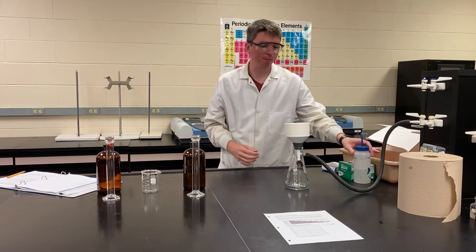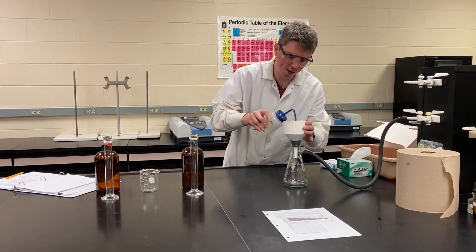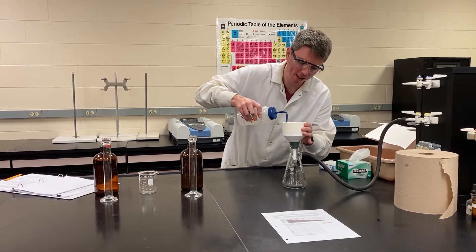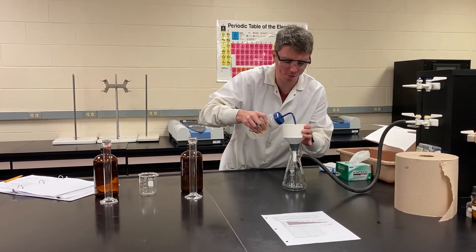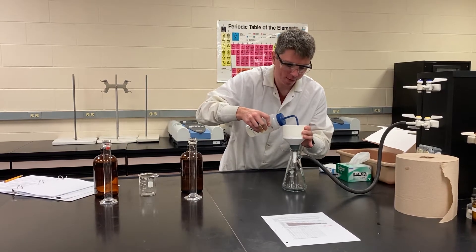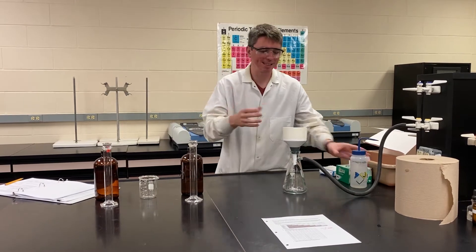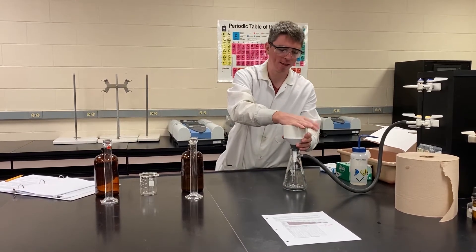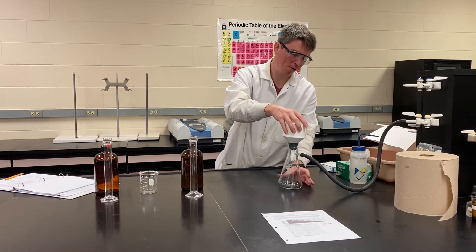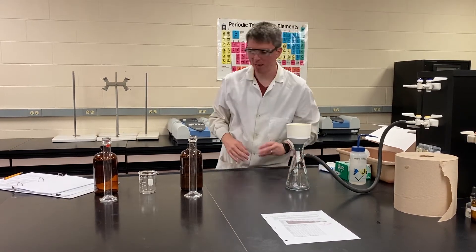To really complete the seal, what you want to do is take a DI wash bottle and spray down your filter paper and let it suck the water through the filter, which just helps complete the seal. If you were here in person, there's actually a sound change you hear as it does this. And now you can see that the vacuum is completed — it's sealed up now.